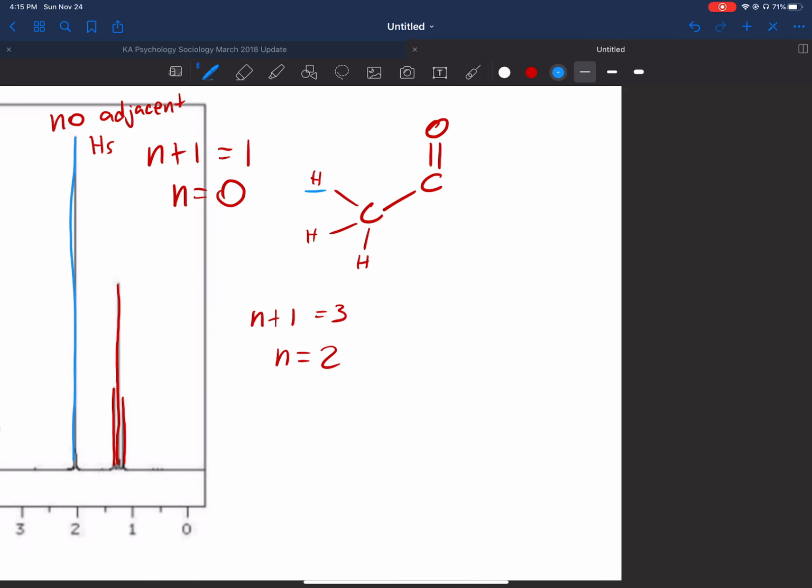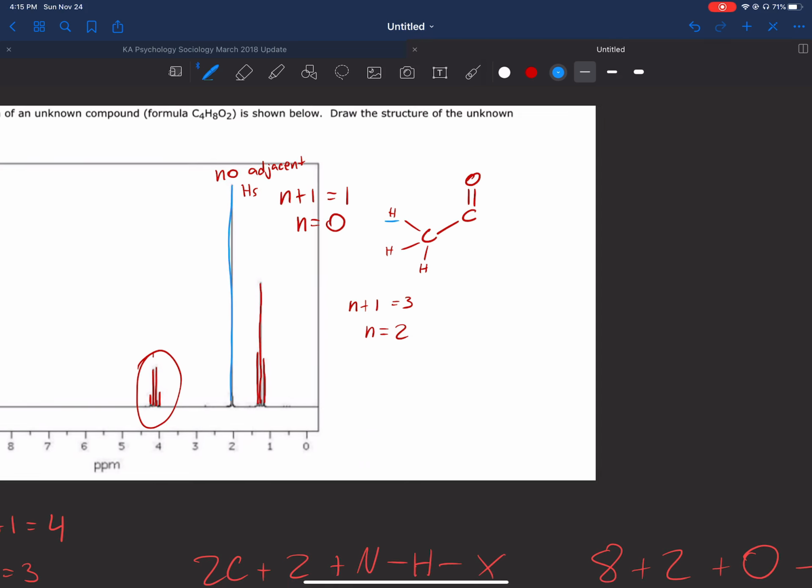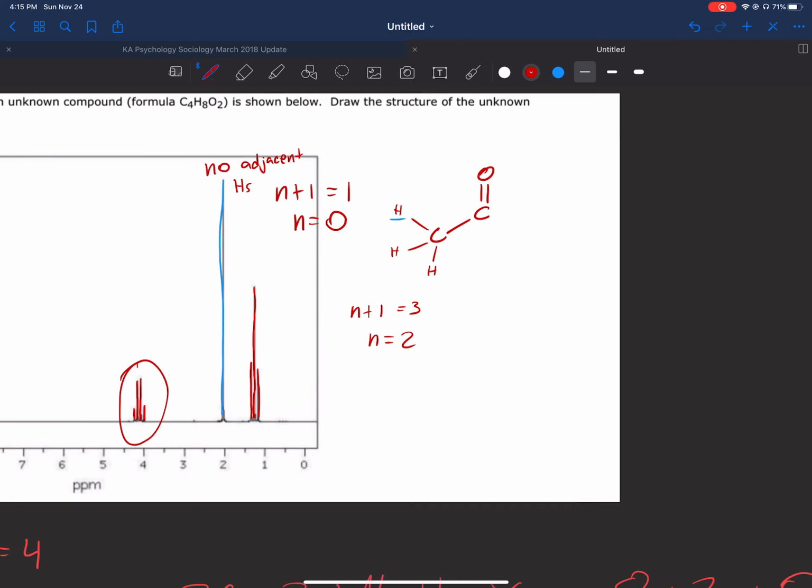Okay, the methyl off of the carbonyl carbon. All right, that's so far 2 of our carbons down. We just have 2 more carbons and 1 more oxygen. The hydrogens will fall in place pretty easily. You don't have to worry about them like that. So now what do we have to do?